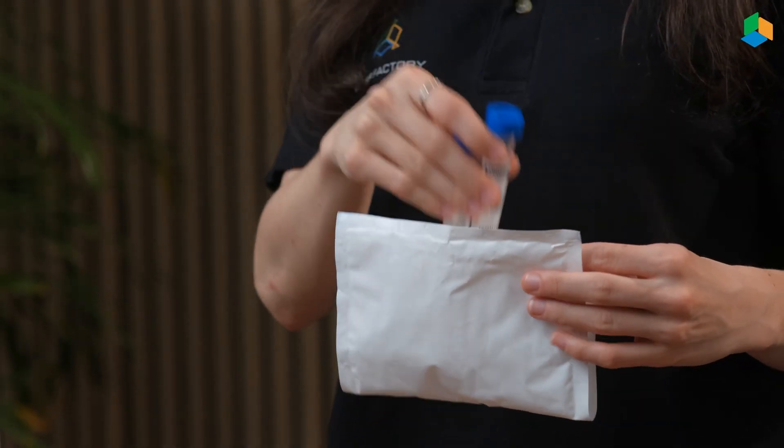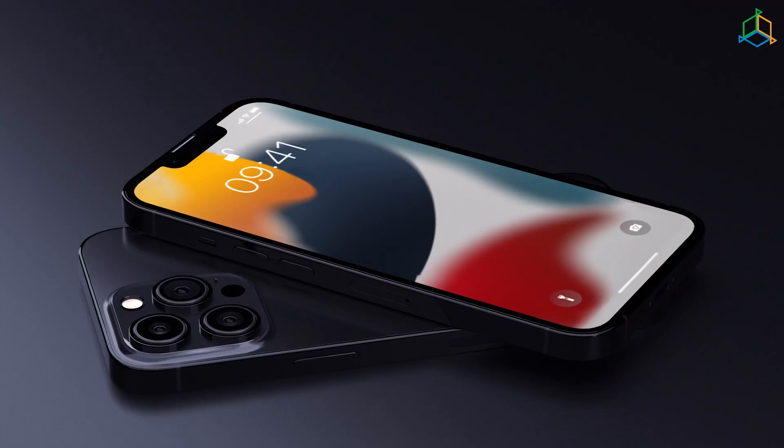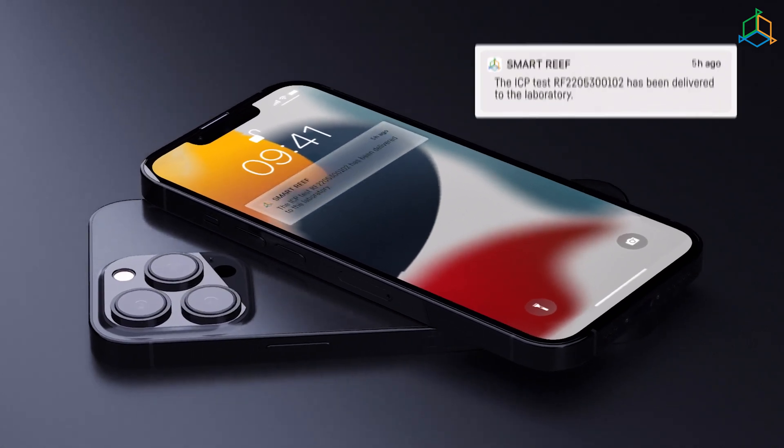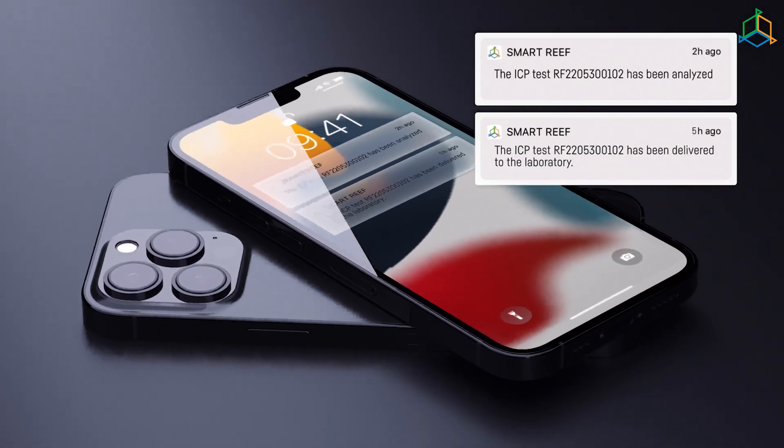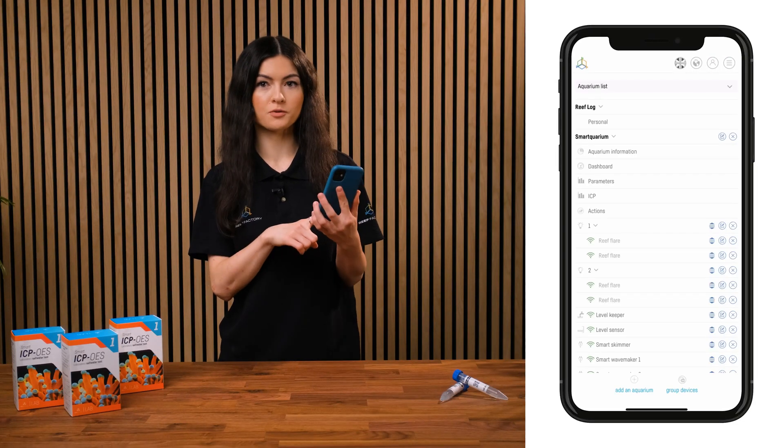And soon your test results will appear in the ICP section. When your samples arrive at the lab and the analysis begins, we will send a notification to your app. When the results are ready, they're sent straight to the ICP tab in your SMART Reef app.